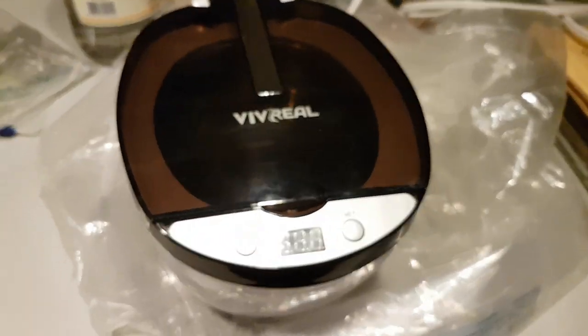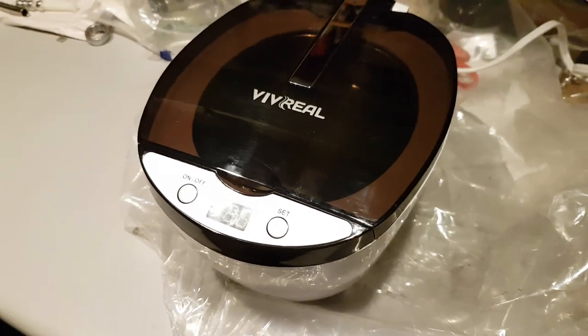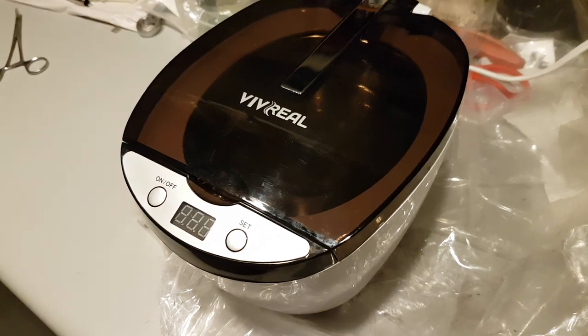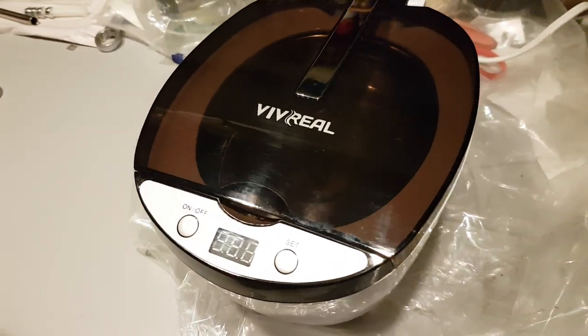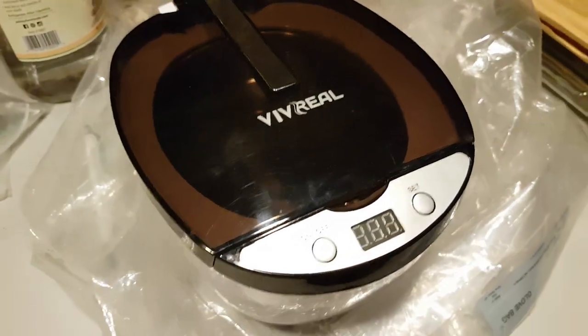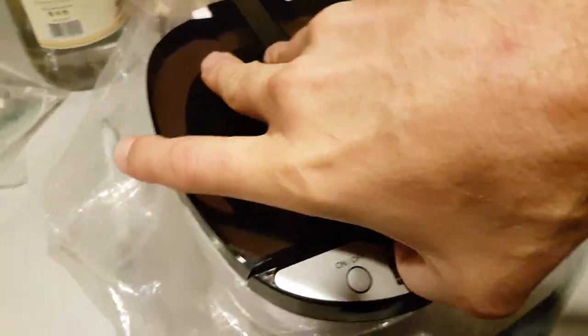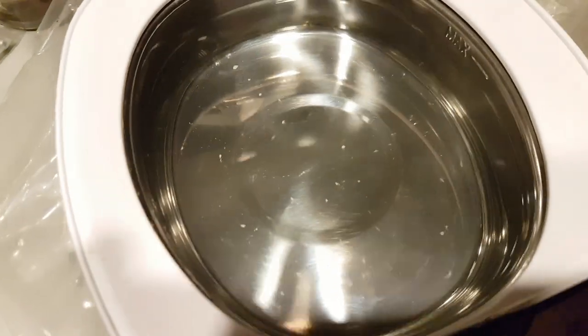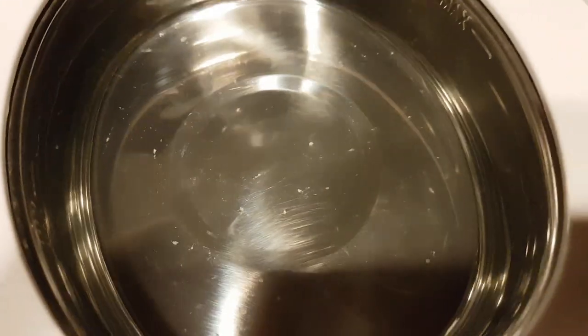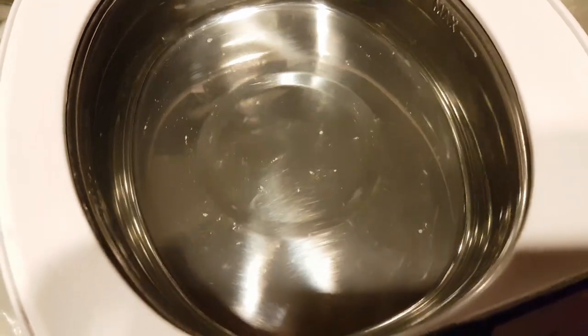Here is the Viv Real ultrasonic 42 kHz cleaner, which costs something like $40. Inside you can see it's a small cavity, more than enough for experiments. But at the bottom, I think you can see some cavitation pits.